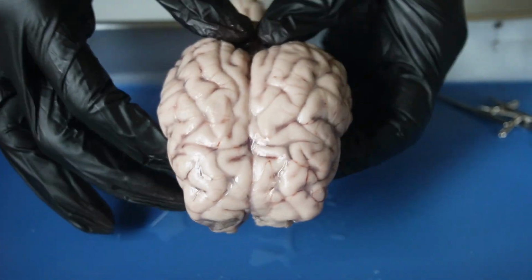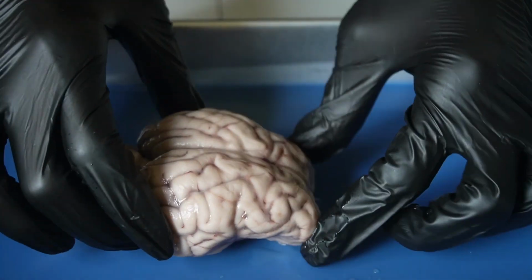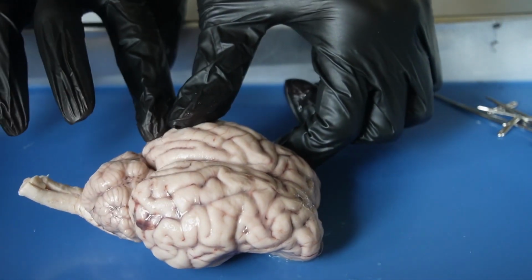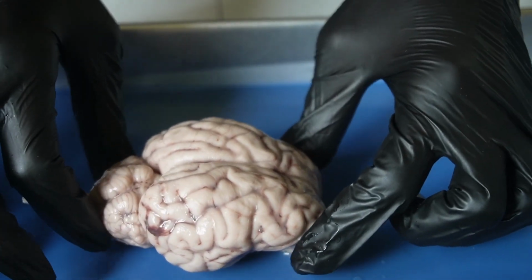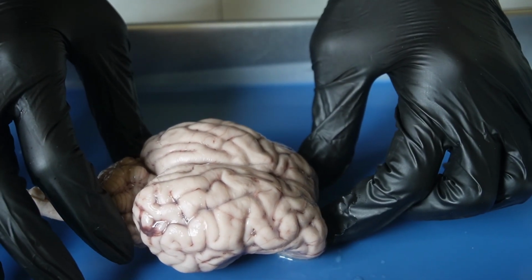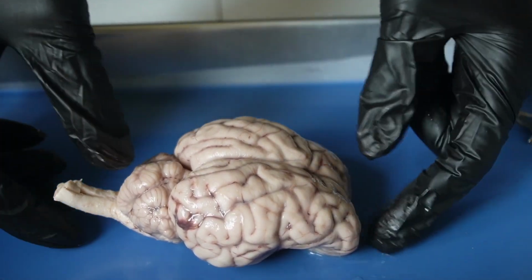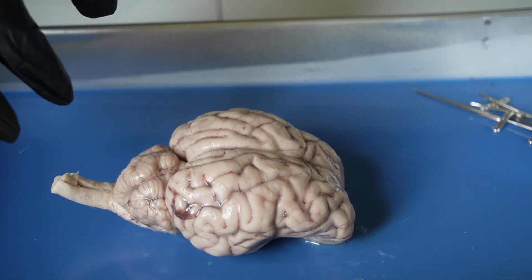The cerebral cortex contains the frontal, the parietal, the occipital lobe here, as well as the temporal lobe here. It also facilitates higher functioning roles such as learning, memory, language, and movement and/or perception.